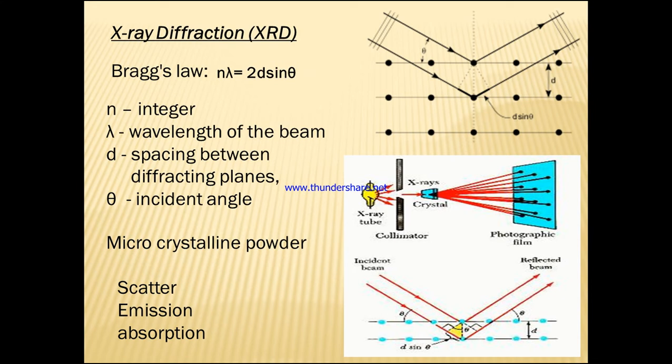So the X-rays which are being produced have to pass. The X-rays which are produced have to be made narrow instead of a spread beam, and they have to pass towards the crystal here. So that is done by using the collimator here. So the monochromator we are having absorbs the undesirable radiation and allows the required wavelength to pass through the material area. After this collimator we are having the monochromator.